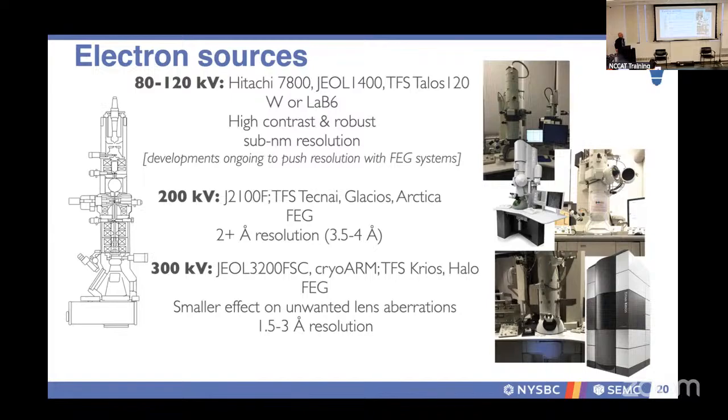But I would have to say that the environment also matters quite a bit. On our Glacios 2, we have a Spicer field cancellation system. That has tremendously helped, because in that room we have 4 microscopes. That particular microscope has a Selectris and Falcon 4i, and we can really push resolution quite well. That form factor is not just a screening microscope, it's a data collection microscope outright. Some people have come to our center not requesting our Krios, but our Glacios 2 specifically for data collection.